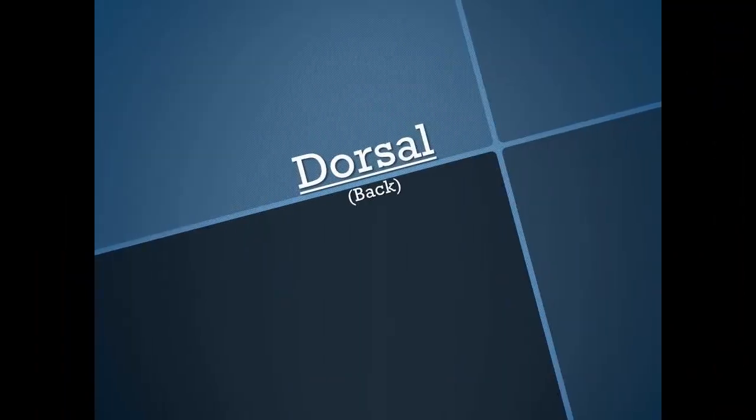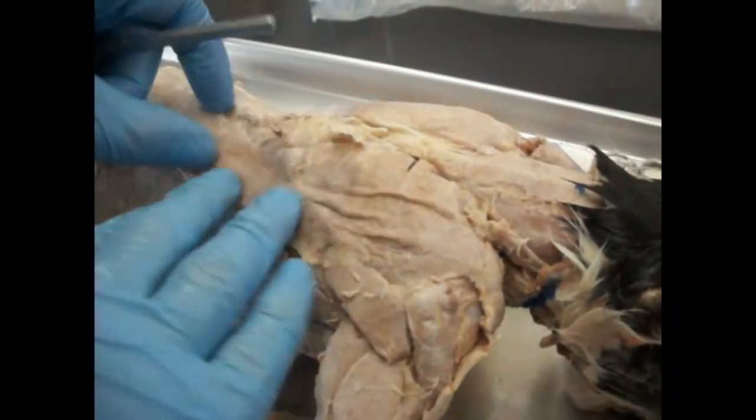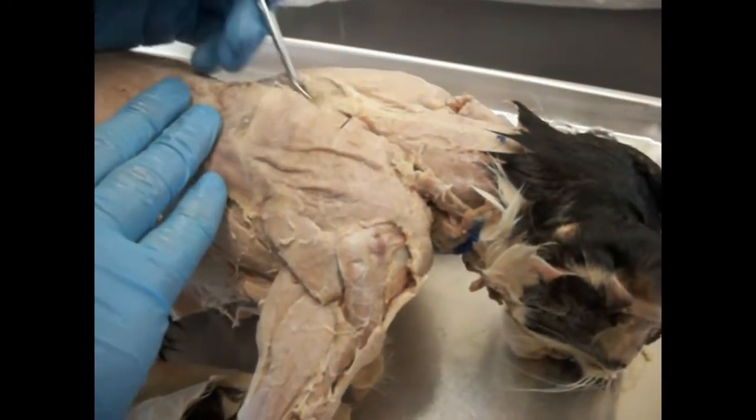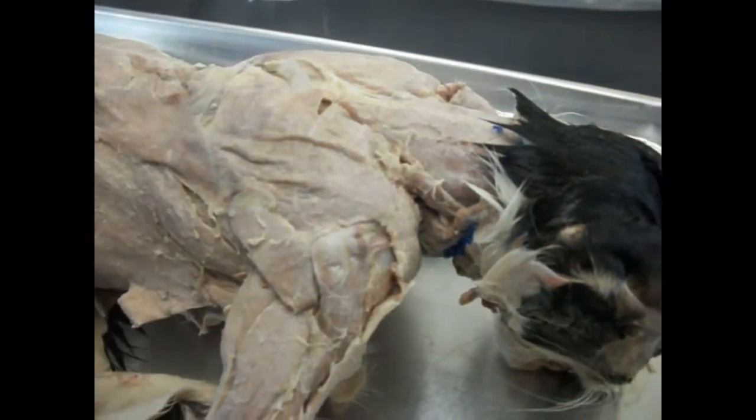So the last muscular section that we are going to be reviewing is the dorsal. As you can see, the muscle that I'm holding with my right hand is called the acromiotrapezius, as I'm patting it down. Now there was a lot of adipose tissue on our cat. Sorry guys, it was just really bothering me and I had to remove it.